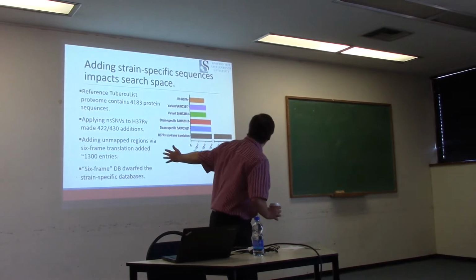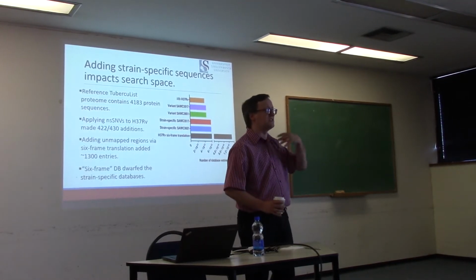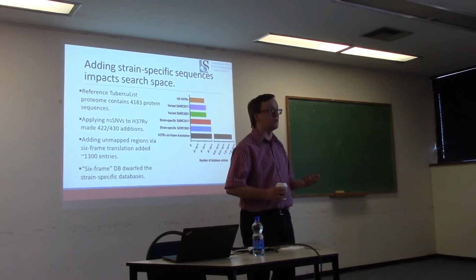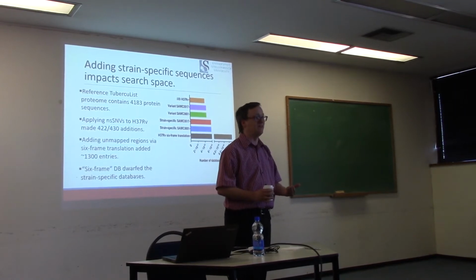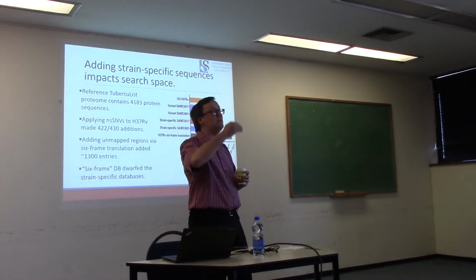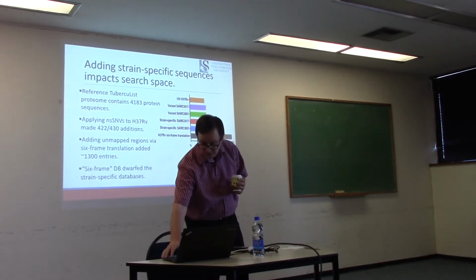As you can see, the number of protein sequences explodes to the right if you attempt to do a 6-frame of everything. And for a lot of people who are doing their first proteogenomics experiment, they attempt this 6-frame translation approach and realize that they're in over their heads very, very quickly. So we needed to limit the amount that our search space grew by doing proteogenomics.